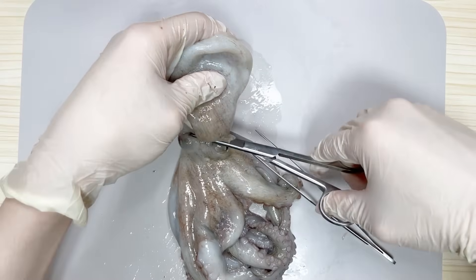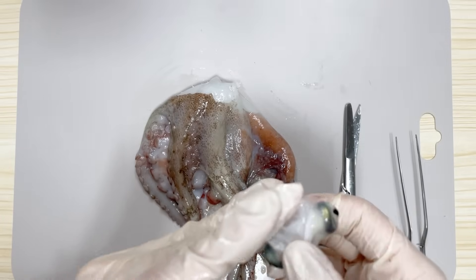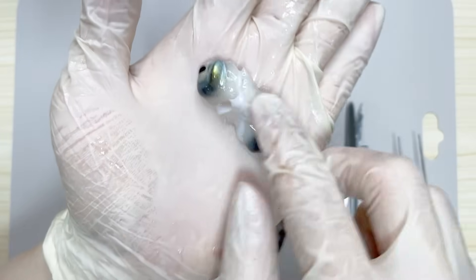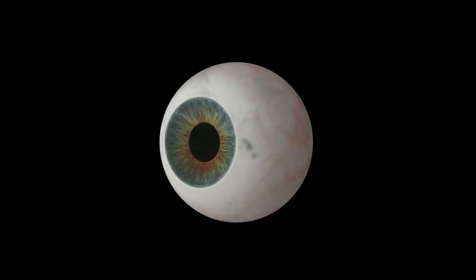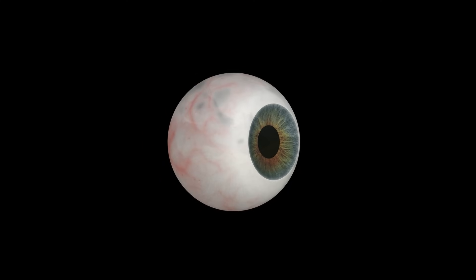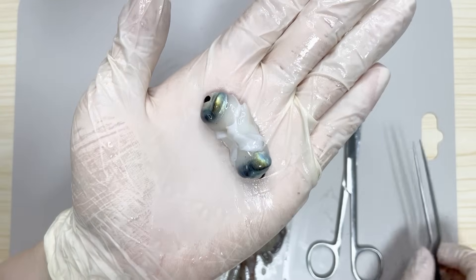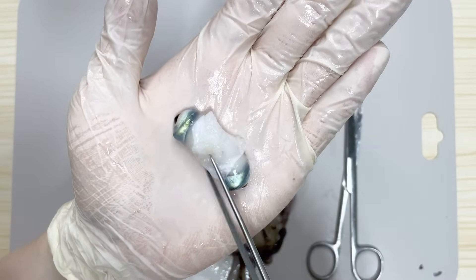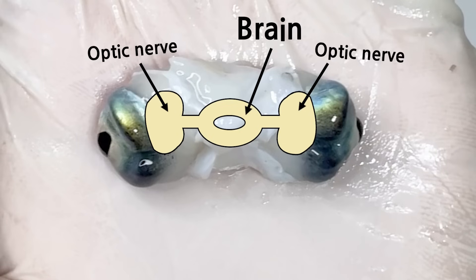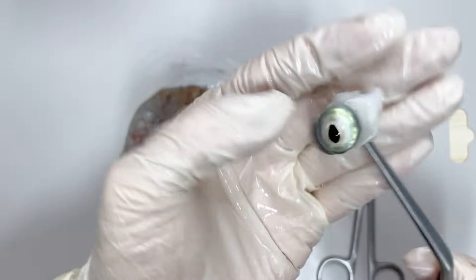Lastly, if we cut open the body and split open the head portion, we can see the octopus's eyes. The eyes of cephalopods have a camera-like structure similar to the eyes of vertebrates, and they are highly developed. Between the eyes, the optic nerve and the brain are connected. The brain of an octopus is ring-shaped, and even the esophagus passes through the middle of the brain. That's why we can see these openings.